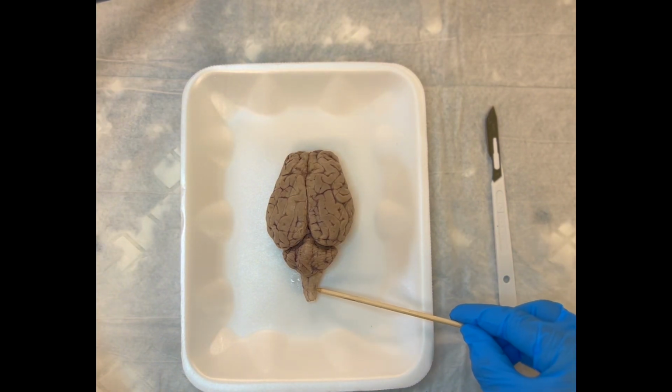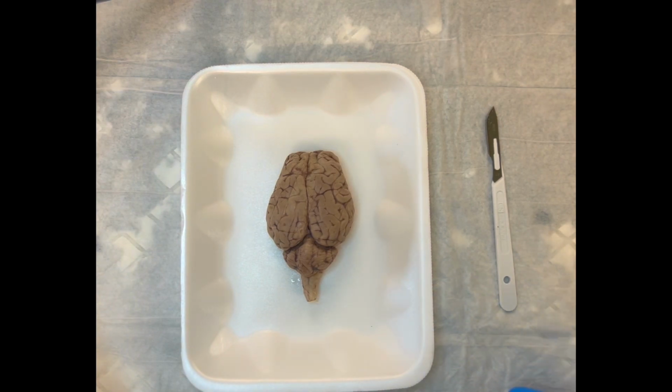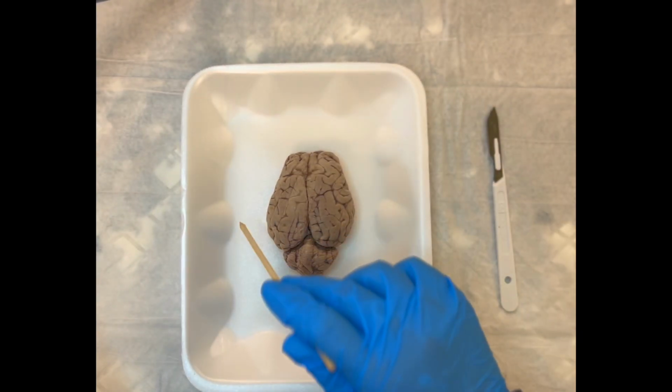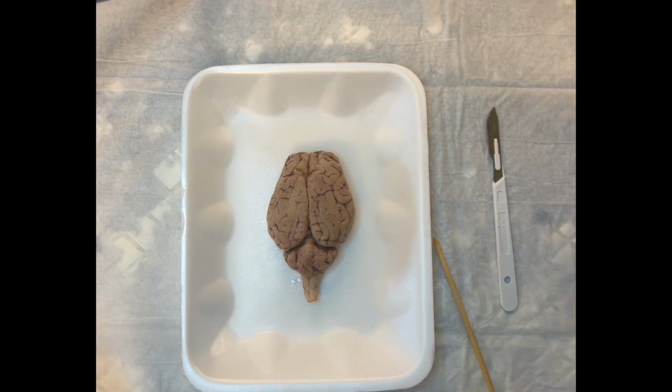Toward the caudal end here, extending out, we're seeing the spinal cord. We do have the brainstem as well, but we can't see a whole lot of it with this view, so I will be flipping the brain over. But you do have your different lobes. So your frontal lobes toward the front, parietal lobes, temporal on either side, coming back toward the occipital lobes.